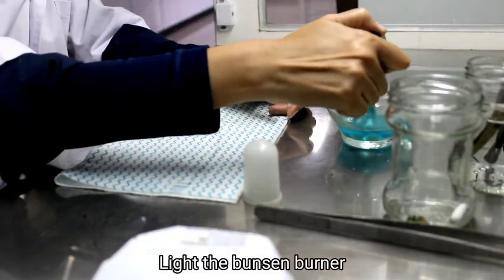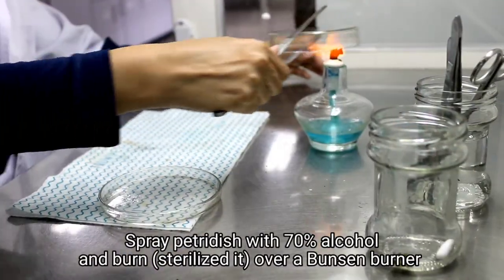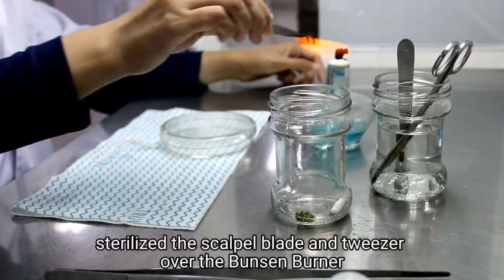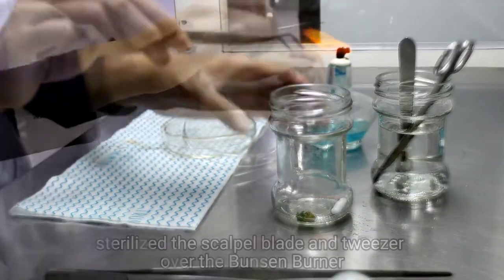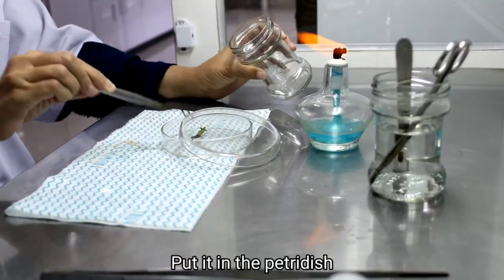Light the Bunsen burner. Spray the petri dish with 70% alcohol, burn and sterilize it over the Bunsen burner. Sterilize the scalpel blade and tweezer over the Bunsen burner. Take the potato explant from the beaker glass using tweezer and put it in the petri dish.